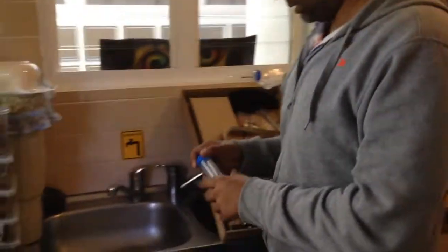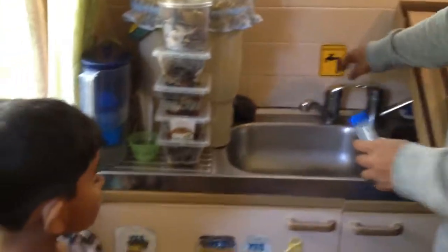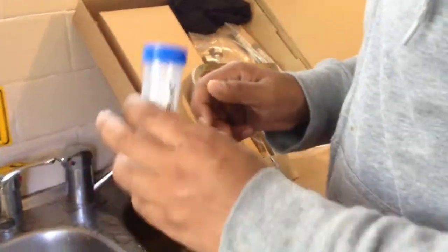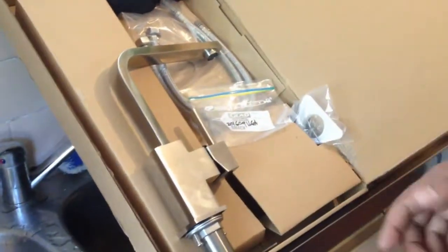Now I am taking samples of water from this tap. This tap is actually made of brass, which will be removed very soon with a new non-brass type of tap which you can see here. So I am just taking samples of the water.